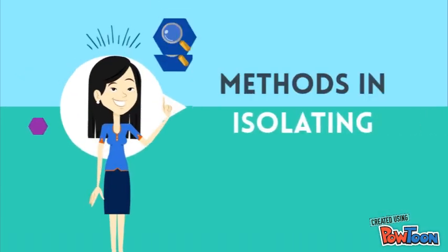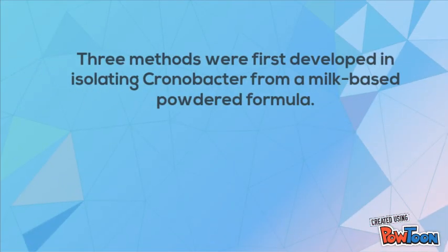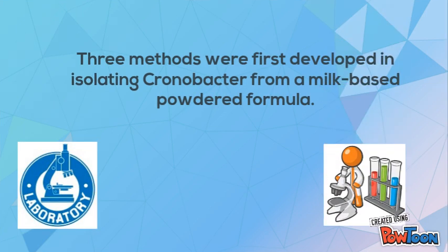Methods in isolating Cronobacter. There are 3 methods that were first developed in isolating Cronobacter from a milk-based powdered formula.